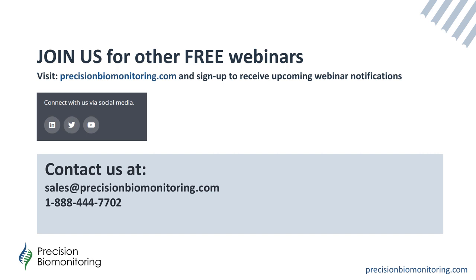Great, thanks. We have one more here. Does PBI recommend a specific thermocycler for the triple lock assay? So it has been validated on the CFX96, but it is compatible with others that would need to be validated internally, again, within your own regulations, both as an institute group and federal and provincial requirements. But the test plates can fit in quite a few other instruments and should be effective where the fluorophores are compatible.